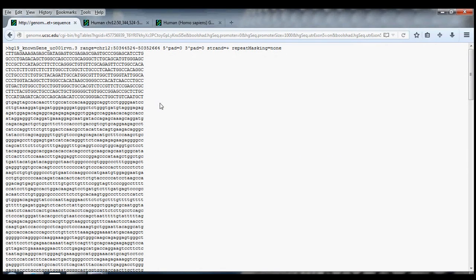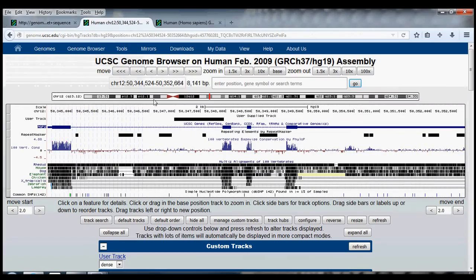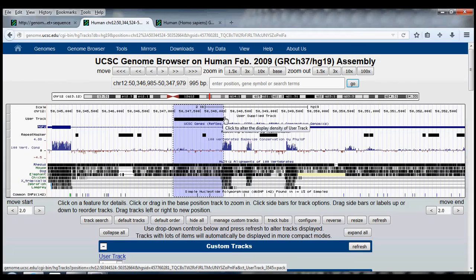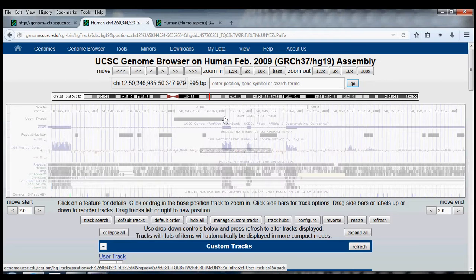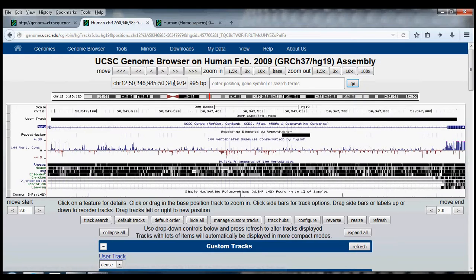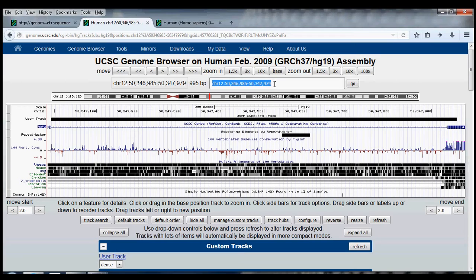Now let's say I did not want the entire sequence of the aquaporin-2 gene, but instead I wanted just the sequence of the 3' end of the first intron in aquaporin-2. So I just highlighted that 3' end, and up here I can see the coordinates of this region. I'm going to show you how to use the Table Browser to find the sequence of these exact coordinates. So first I will copy these coordinates.